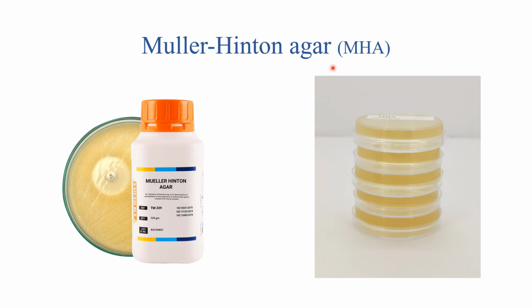Mueller-Hinton agar or MHA. This MHA is used for antibiotic susceptibility testing in the case of this diffusion method. And this Mueller-Hinton agar is a non-selective and non-differential medium.